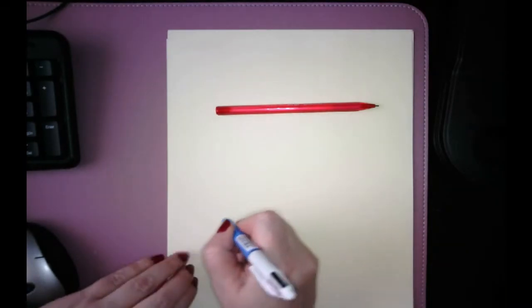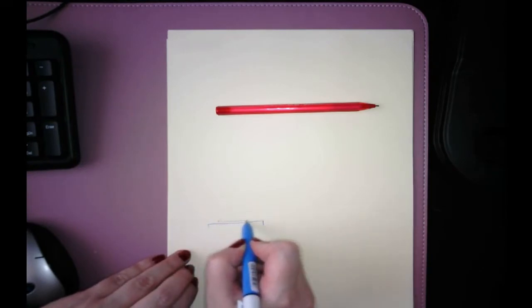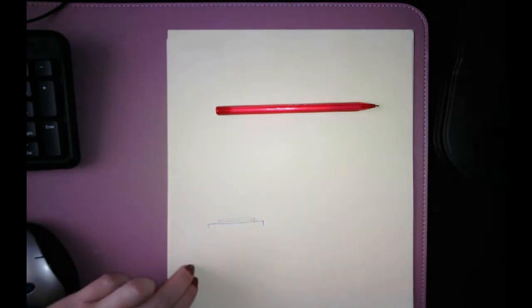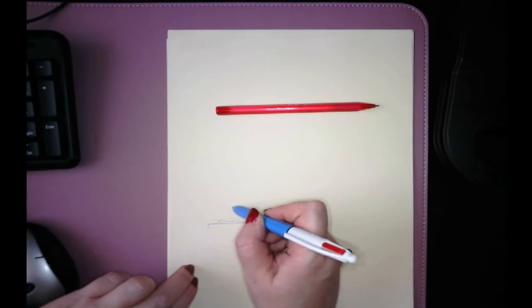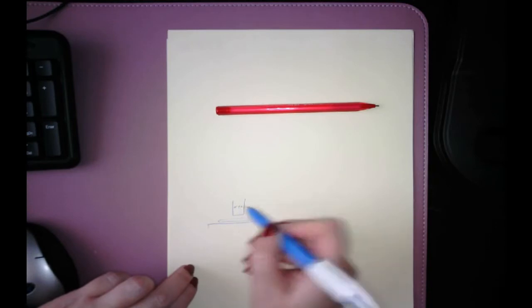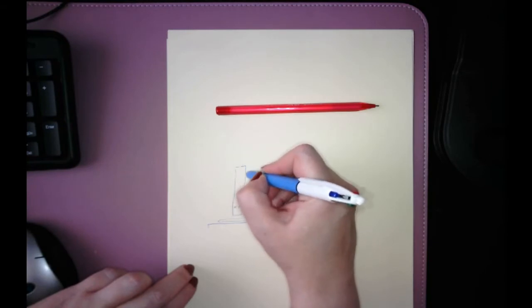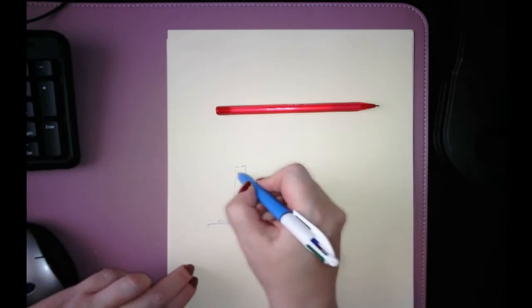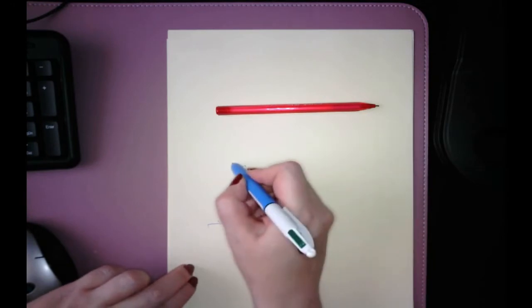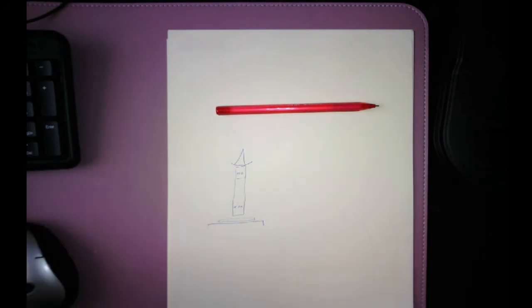Now obviously with a microscope, by this point you would have had, here's your stage where your pen would be on, or whatever your sample is. Let's draw a pen, very badly. You would have then had a lens, which would have magnified it by some amount. Let's go times 10. It would have then gone up, and then your eyepiece, drawn separately, would also have a times 10 magnification. So by the time it gets to the bit where your eye sees it, it's been magnified a few times. The size has been changed.